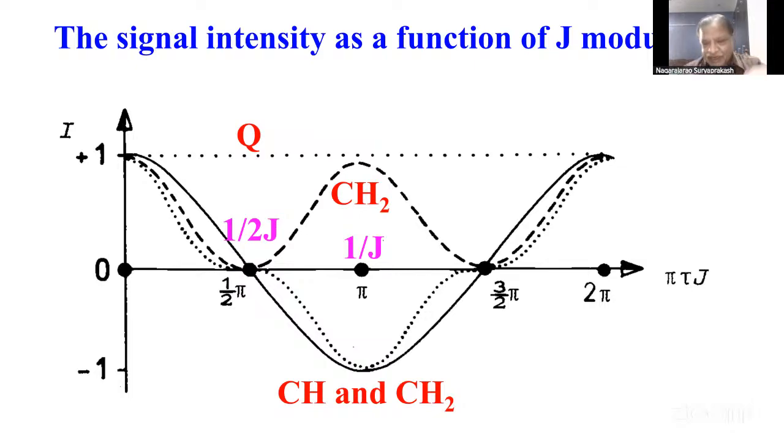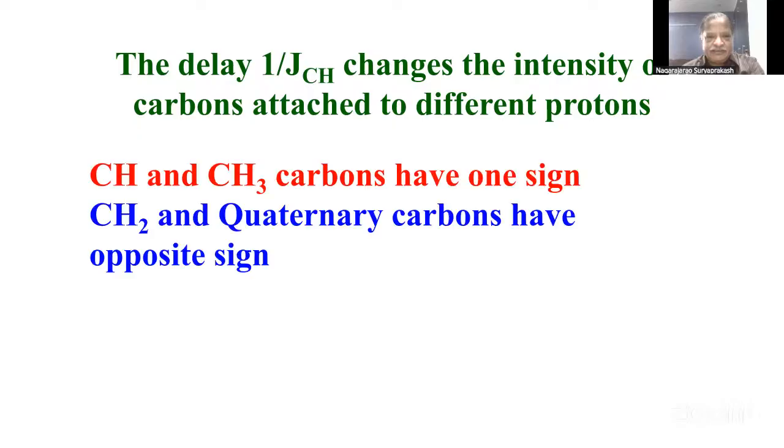But at the same time, if you want to do the decoupling, simplify the spectrum, and also identify which is CH, which is CH2 and which is CH3, this experiment is done. It is called attached proton test. Am I making sense to you? Yes, sir. Okay, anything else?